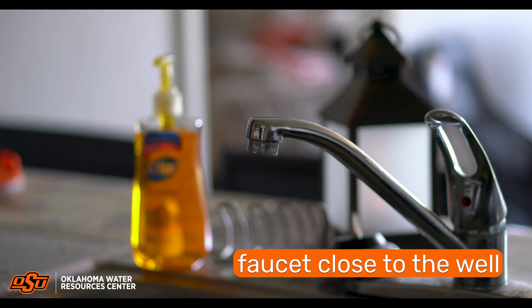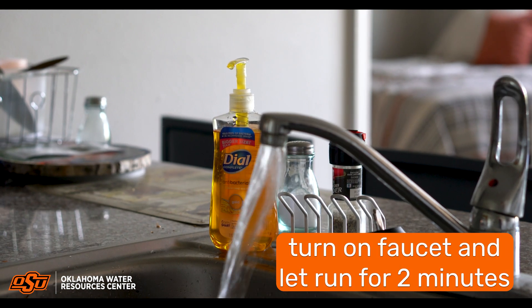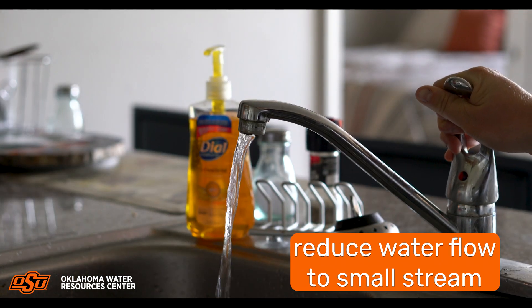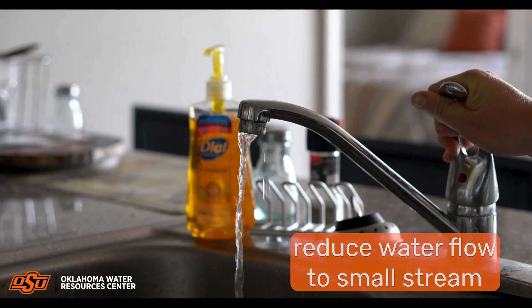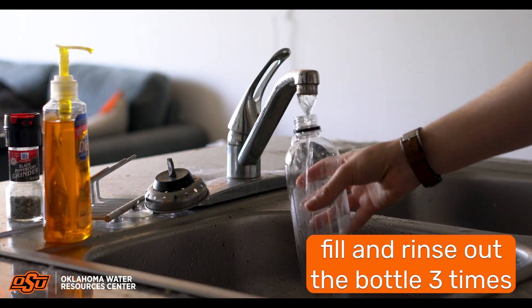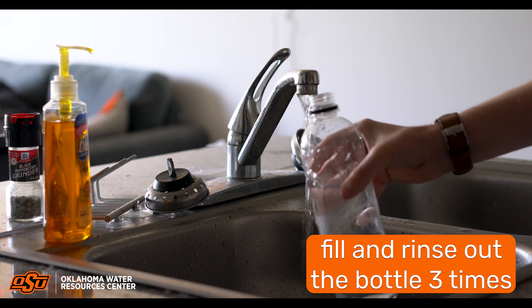Utilize a faucet as close to the well as possible for collection. Turn on the faucet full force and let it run at full force for two minutes, then reduce the water flow to a small stream. Fill the water bottle from your faucet and empty the bottle, rinsing the inside of the bottle.